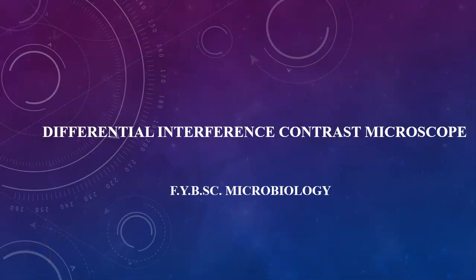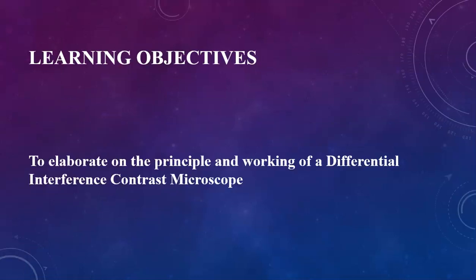Dear learners, the topic for discussion in today's video lecture is a new topic. It is DICM, Differential Interference Contrast Microscopy. This is one of the topics which we shall be learning today and discussing, with respect to one more type of microscopic advancement and a modified version.